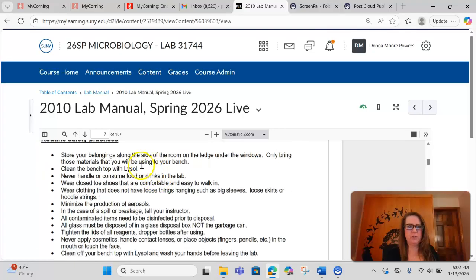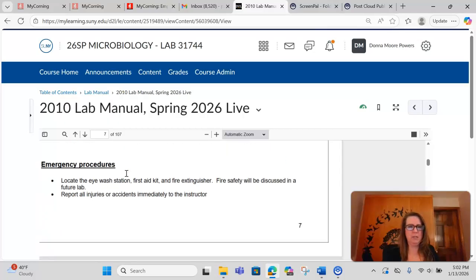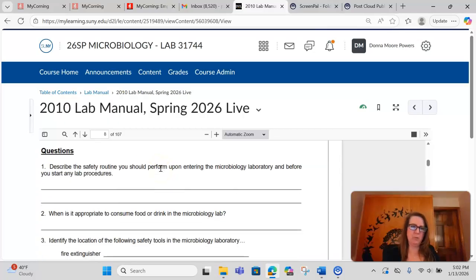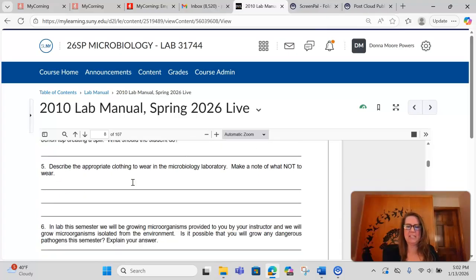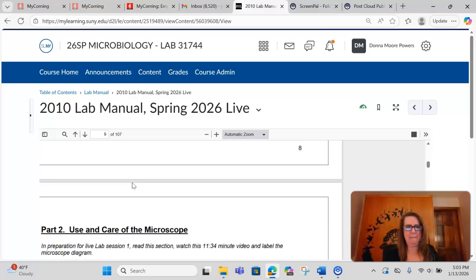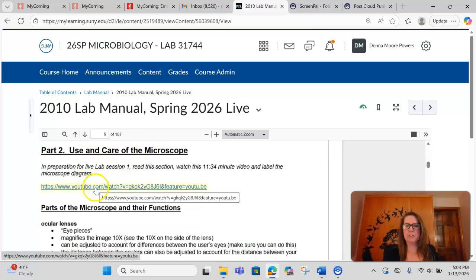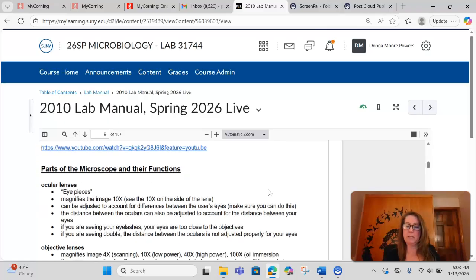So you watch this video, you read through, you know how you're going to come into the lab, which you can and can't do in lab. Emergency procedures like the eye wash station, and here are some questions. So this is the pre-work, and if you can't answer something, then when you come into lab, you, for example, can look around to see where's the eye wash station, where's the fire extinguisher, things like that, to be prepared. Use and care of the microscope. Here's an intro video to how to use a microscope. Will we also talk about this? Yes, of course. Am I going to talk about it for 25 minutes? I am not. We have an hour and 50 minutes together.